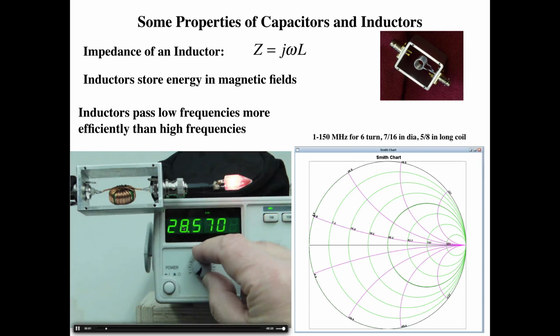So here at low frequency, 28 kilohertz, you see the light is already on. Keep increasing the frequency, and you see the light goes off. So we keep ramping it up a little bit, and the light will stay off here. And now we'll get up to about a megahertz. Now we're going to drop the frequency again. So we're dropping it, the light's off, and eventually at lower frequency it comes back on.